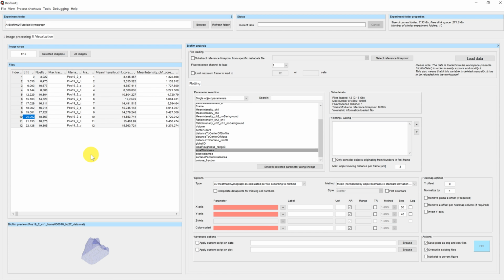My name is Hannah and today we're going to have a look at the different scatter plot options in the Visualization tab. You can see that I have already loaded a directory here. In previous tutorials you have learned how to do so, as well as gotten an overview over the different areas in the Visualization tab.